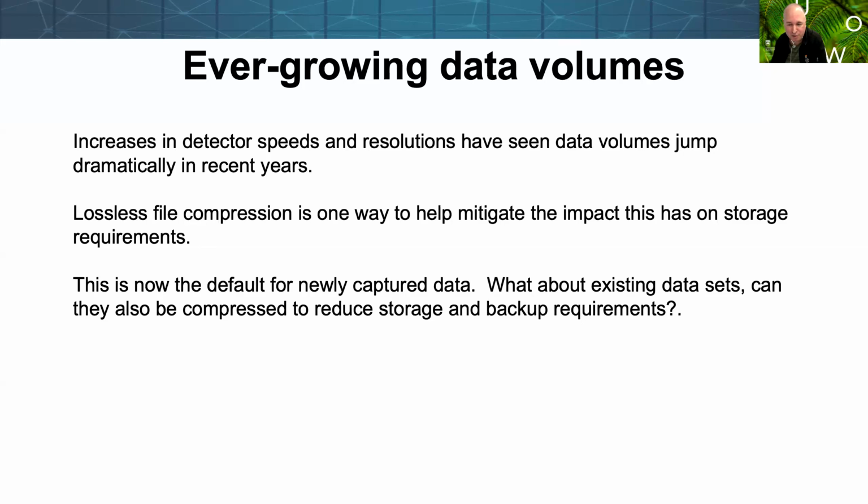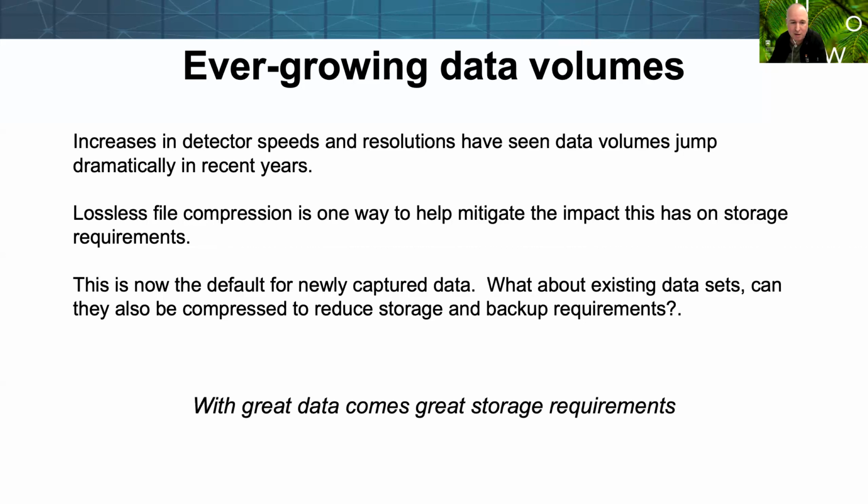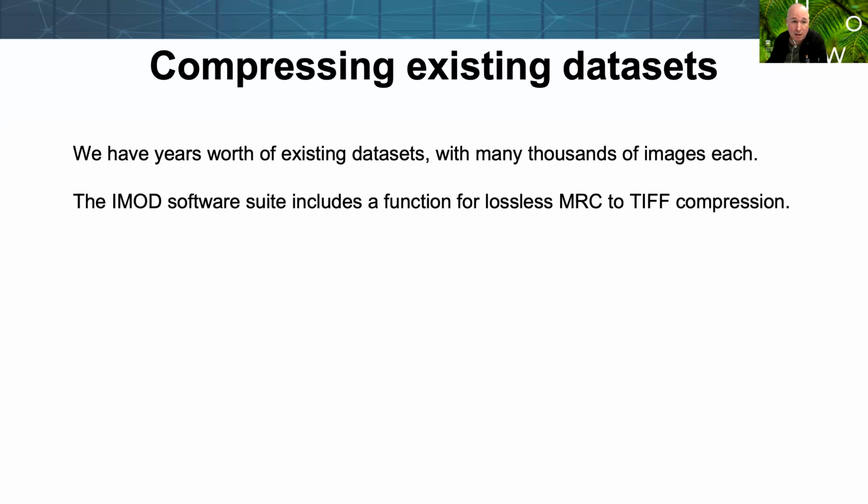But we had a whole bunch of existing data sets from the last couple of years that were still in MRC format and taking up a lot of storage space, both on our facility storage server, and also in terms of backups and things like that. And then, to pinch a line from Spider-Man and mangle it a little bit, with great data comes great storage requirements. So we were looking at what we could do to improve that.